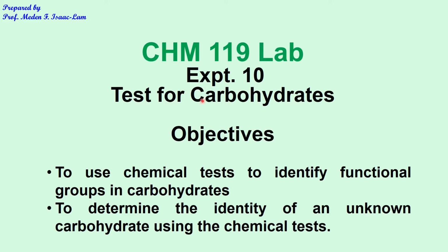Experiment 10 is about tests for carbohydrates. The objectives of the experiment are to use chemical tests to identify functional groups in carbohydrates and to determine the identity of an unknown carbohydrate using the chemical tests.